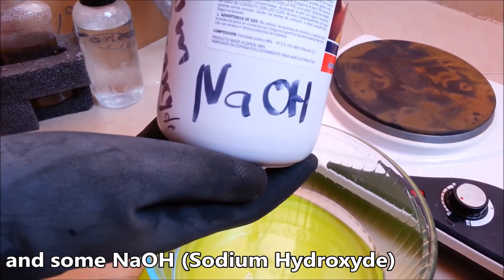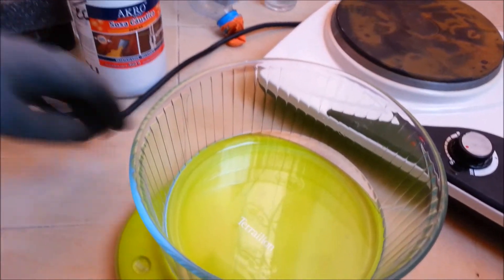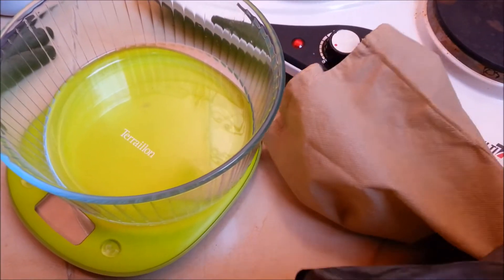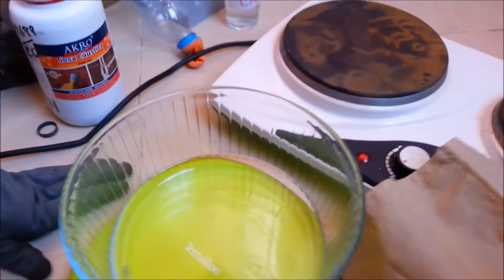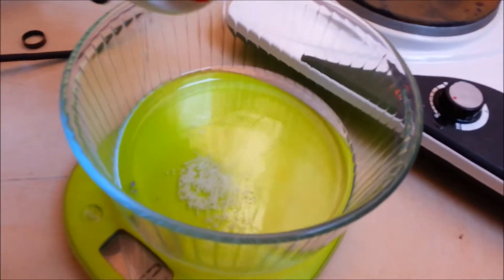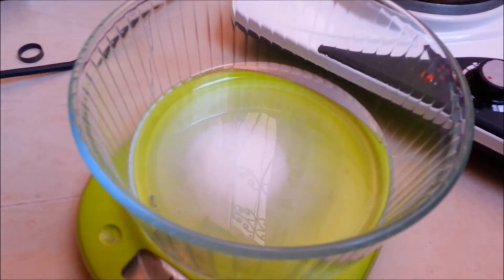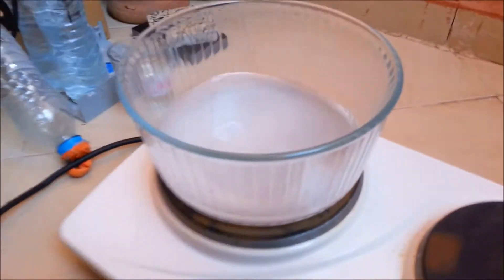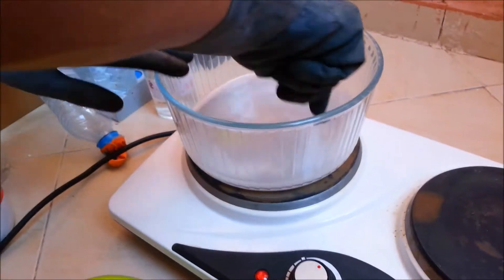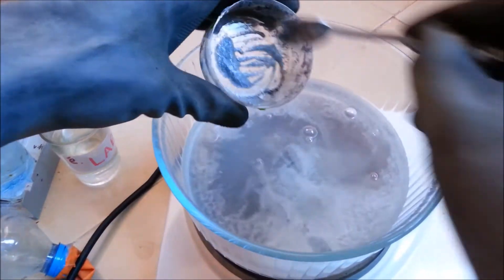We also need some NaOH — sodium hydroxide — and some zinc. Now we have to add about 30 grams of NaOH per 100 milliliters of water to make it more basic. Shake it a little bit, then put it on heat to bring it to a boil. Then we're going to add some zinc to our mixture.